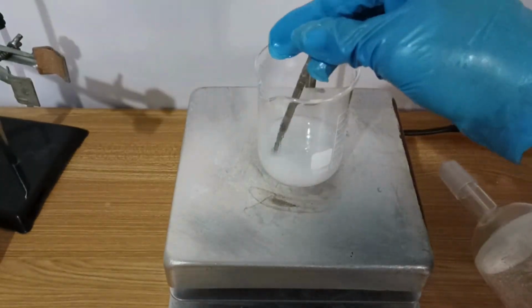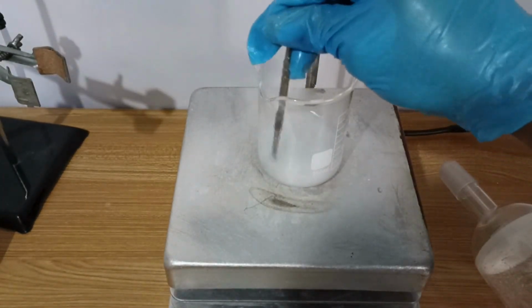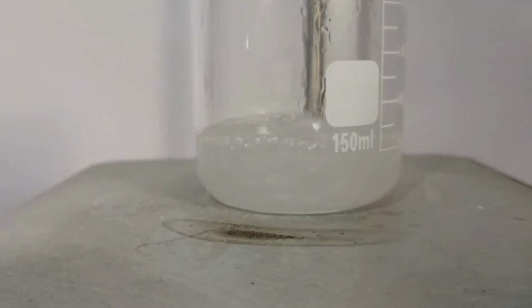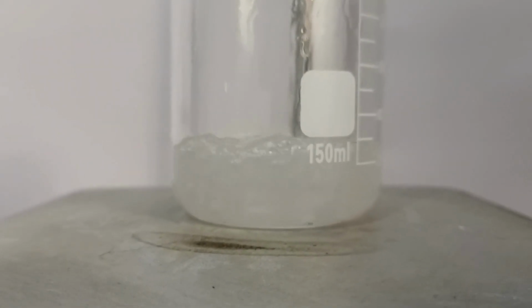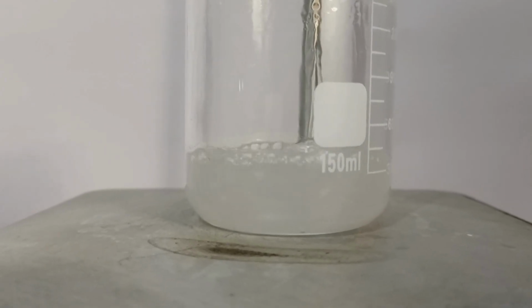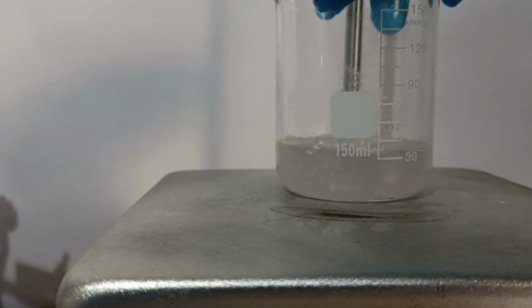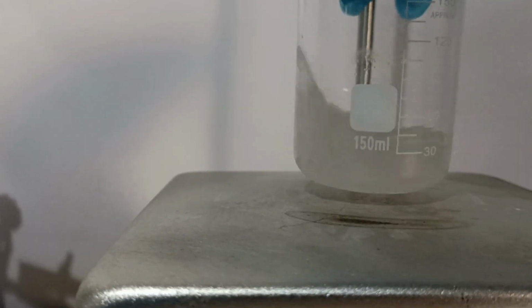The heat was turned on and a little bit more ethanol was added until we got a clear solution. Heat the ethanol until 20 to 25% of the volume has evaporated. As you can see, the purple impurity was still present.